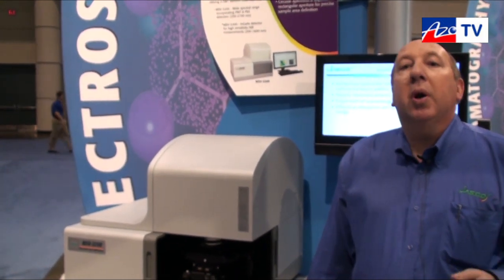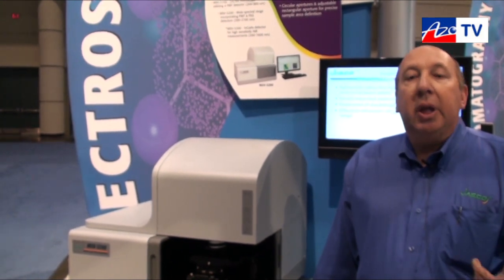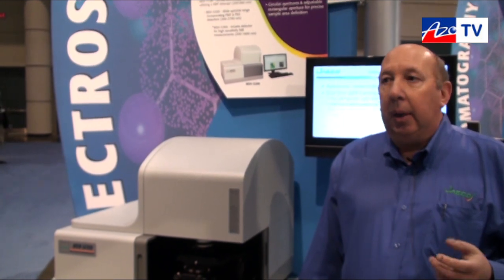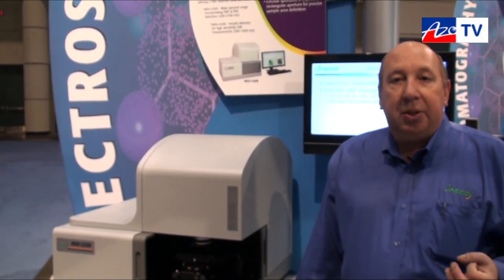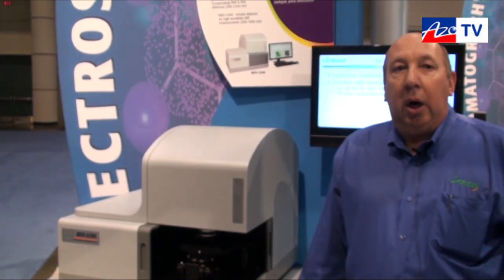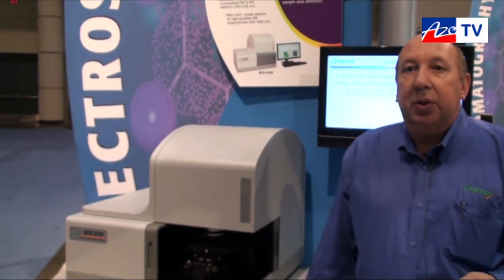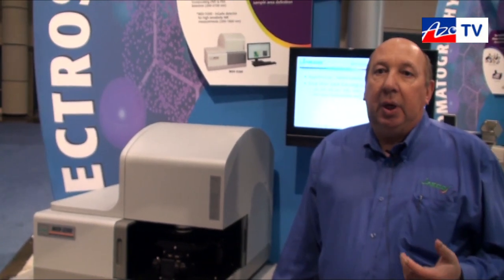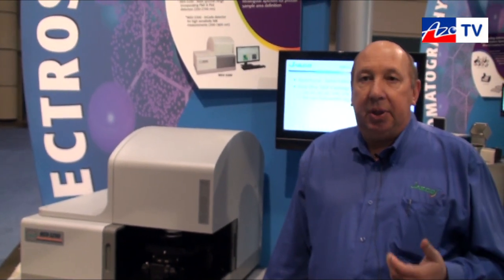We're really excited about the product because there's so much capability here, being able to do small size samples down to as small as 20 microns to as large as a millimeter by millimeter, for instance, and being able to provide a lot of information for our customers as they look at their samples in this system.